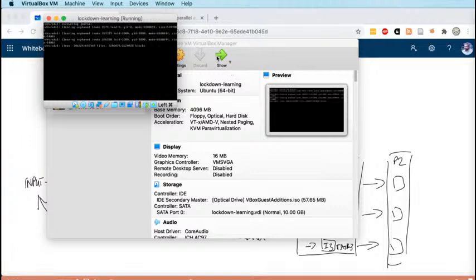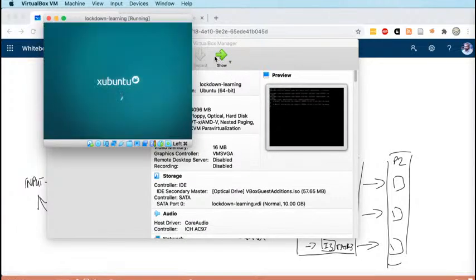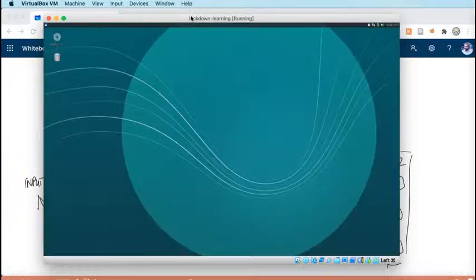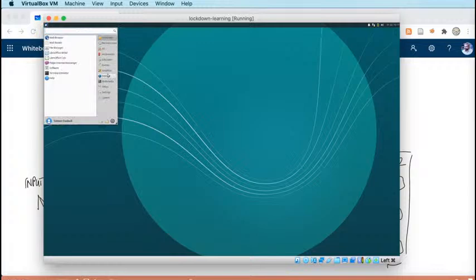So the VM's starting up, and what we'll do first of all is we will take a quick gander at the Nextflow website. So Graham's asking about Conda. It is possible to install Nextflow via Conda, and actually that may make a lot of sense. I'll show you the Nextflow website first of all, and then I'll say why we'll possibly do it using Conda.